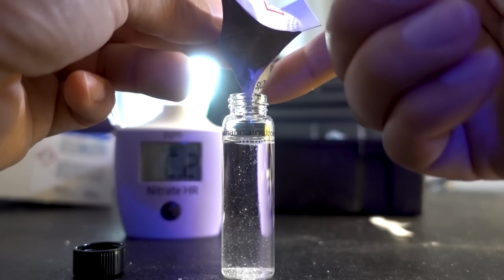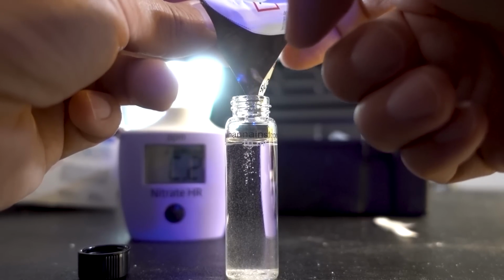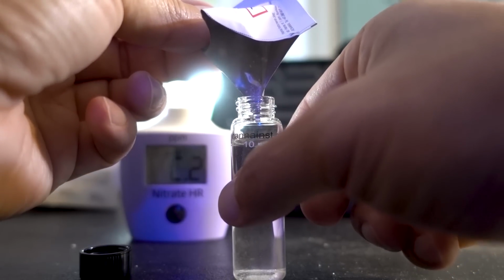Here's the part I absolutely hate. Sometimes the reagent powder would get stuck at the channel, and if I tap it too hard, everything just kind of flies out, and I've ruined a bag of reagents.